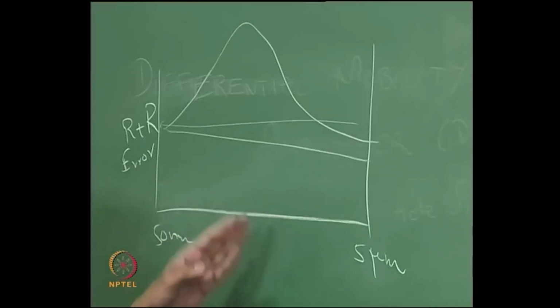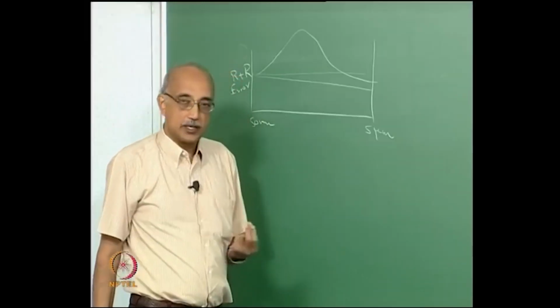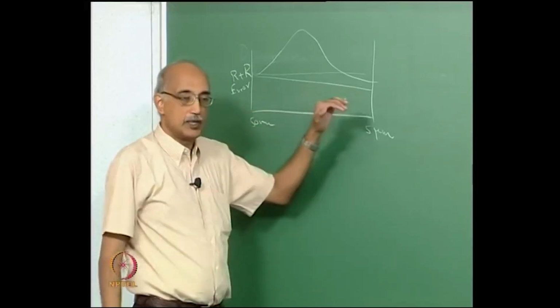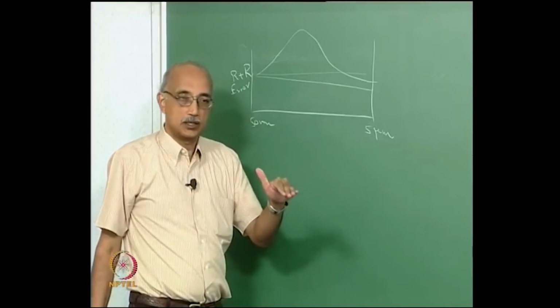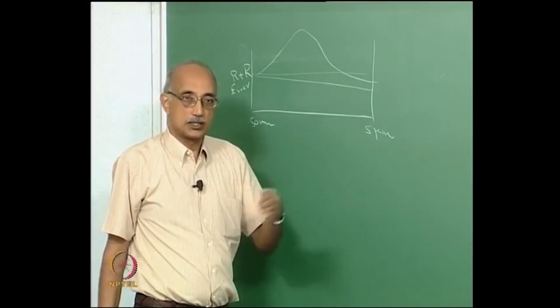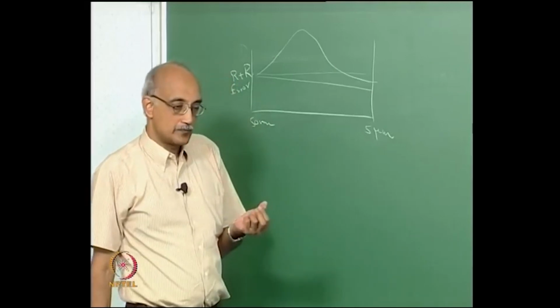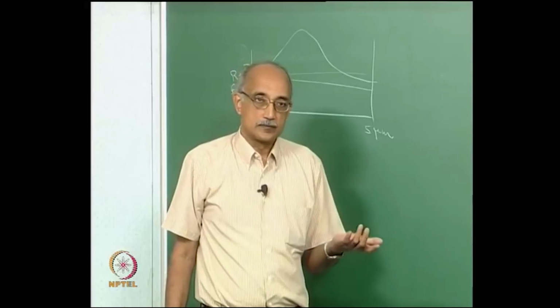What you would like to see is a nice gradual and linear dependence of this parameter on size. Given that in a particle counter it is more difficult to count and size finer particles compared to larger particles, this is the kind of behavior you would expect, that the error would slowly decrease as you go to larger sizes. However, there is the other factor that as the particle counts decrease, the error will increase.